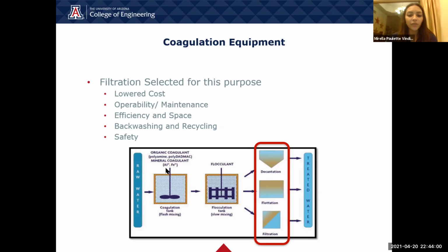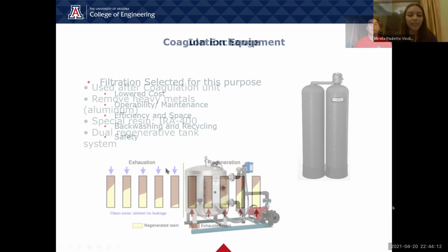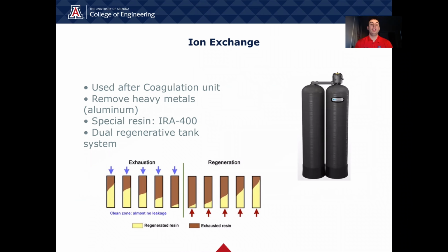In addition, the amount and nature of sludge formed is much more manageable and allows for complete treatment and recycle of the filtered out contaminants. Because the process fluid remains contained in equipment or hosing at all times, this method limits students' exposure to corrosive chemicals and sludge. The ion exchange unit would be installed after the backwash of the coagulation unit.